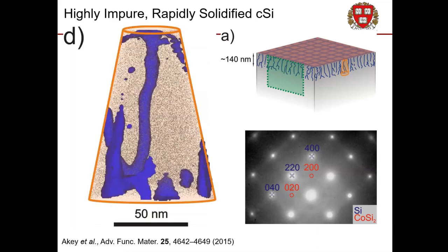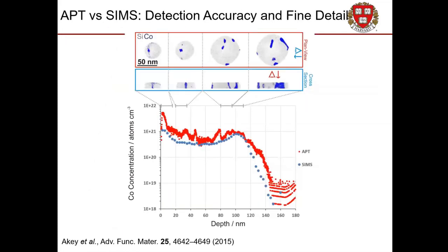Enter Atom Probe, which reveals them to be these lovely, rounded, filamentary structures with occasional detached droplets. So that's very nice. This is the first measurement of the actual structure of these. But we also want to know composition because this is a technologically interesting material, and we need to understand its composition both within and without these structures in order to understand how it behaves.